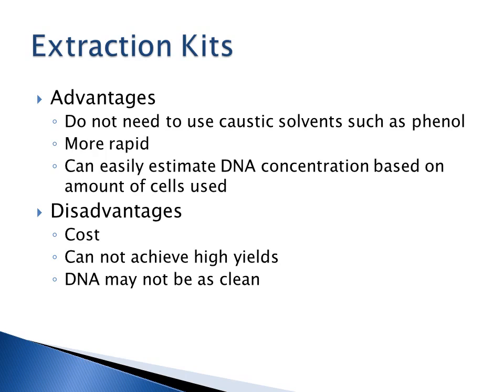Sometimes you don't get quite as high a yield of your nucleic acid with the kits, but the kits have been improved over the years, so you can almost get just as high a yield with the kit as you can with some of the more manual methodology. The DNA may not be as clean, but once again, the extraction kits have become very advanced, and you actually get nice clean DNA at reasonably high yields. So the major disadvantage with extraction kits is the cost.